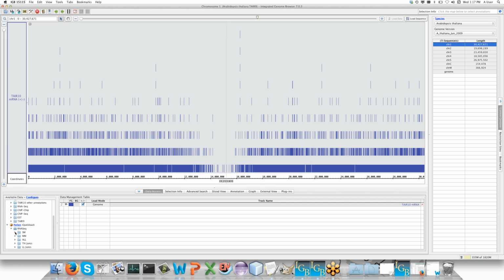When we do our RNA-seq, we separate the single mapping reads, that is, reads that only have a single time that they map into the genome, from the multi-mappers, that is, the reads that can map to 2 or more places.